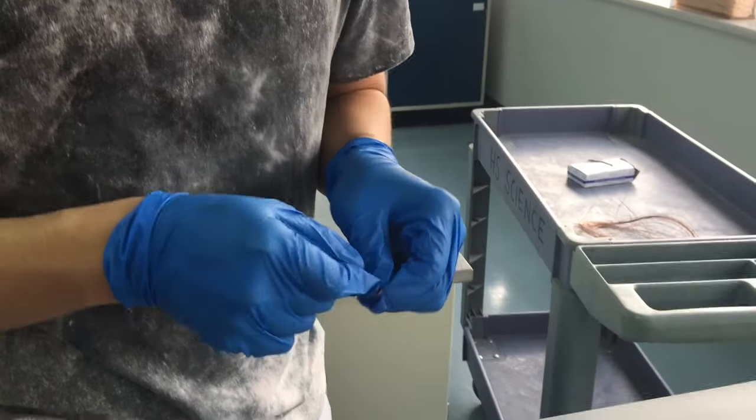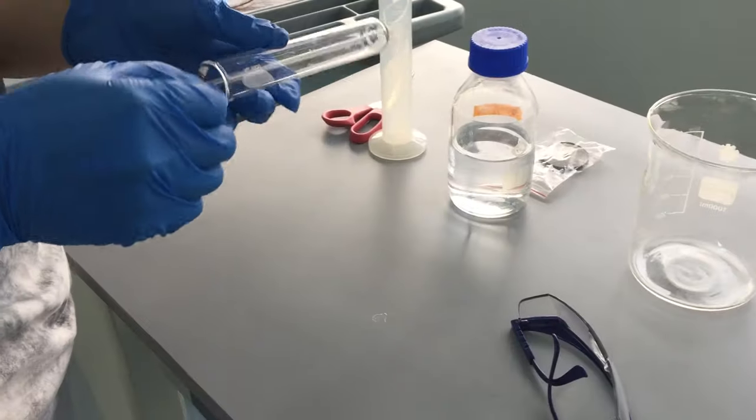Wrap the copper wire around the magnesium ribbon to secure the ribbon inside the test tube.